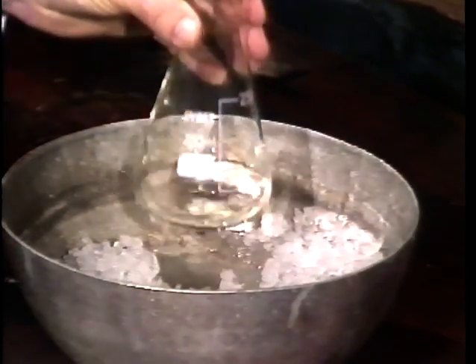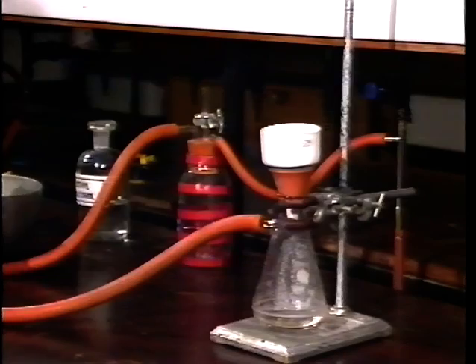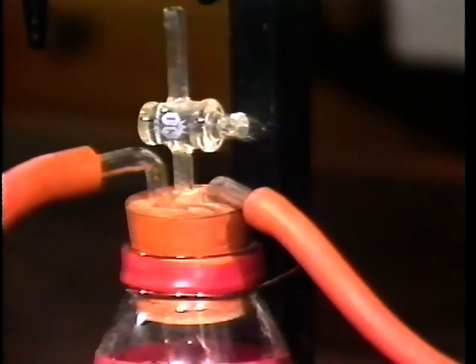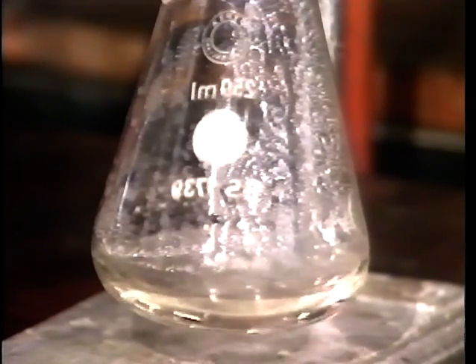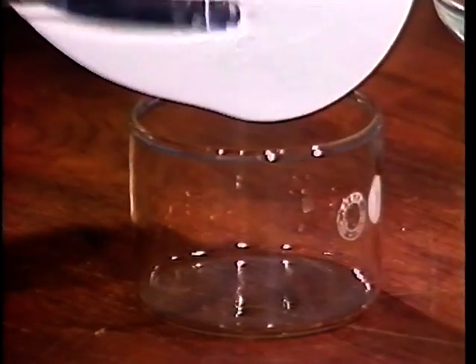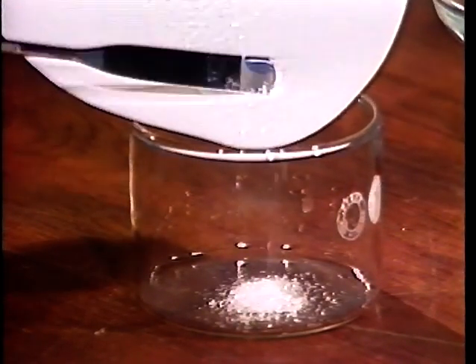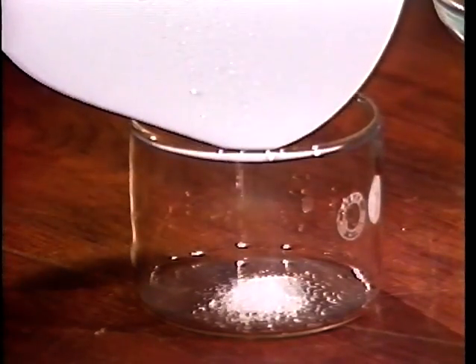Open the tap on the trap and wash the crystals with a little of fresh solvent which has been pre-cooled in ice. This removes any traces of mother liquor left on the crystal surface. Close the tap of the trap and allow the crystals to suck dry in air. Scrape off the crystals from the filter paper into a suitable receptacle such as a recrystallizing dish or a beaker.